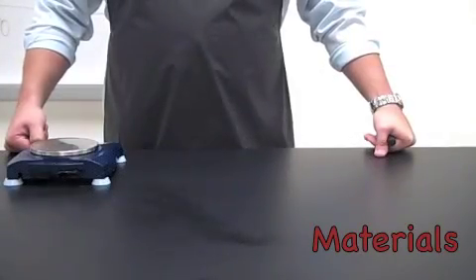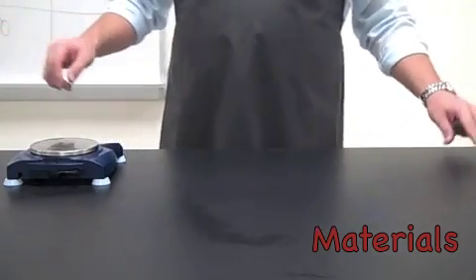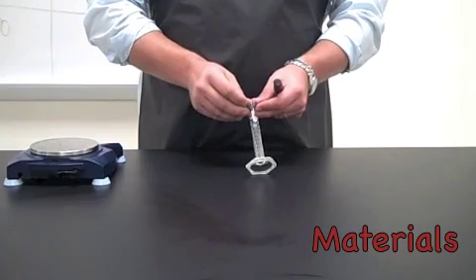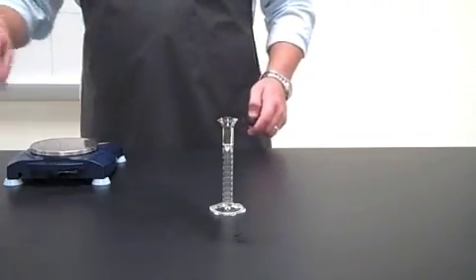Today we're going to be talking about density. Specifically, what we're going to be looking at is beverage density. To start off the lab, we're going to go through some of the materials. What we're going to need for the lab: first, we're going to need a 10 milliliter graduated cylinder. We're going to use this instead of using the pipette in the directions.